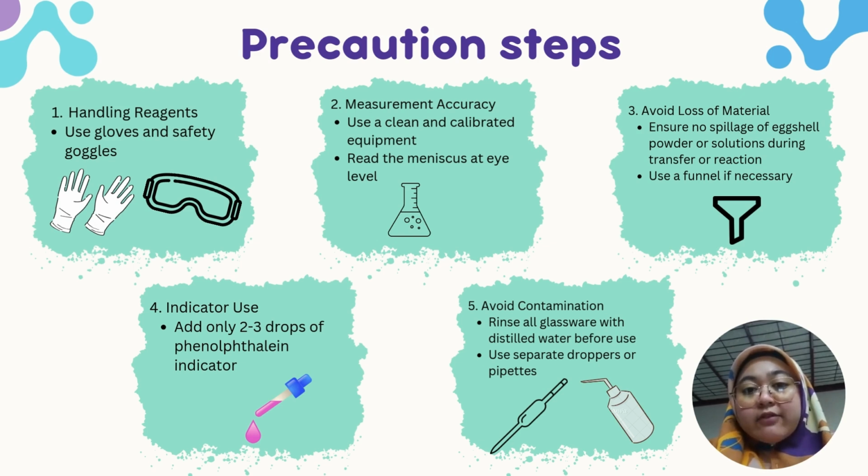Last but not least is avoid contamination. Rinse all glassware with distilled water before use to remove impurities. Use separate droppers or pipettes for HCl, NaOH, and indicator to prevent cross-contamination.